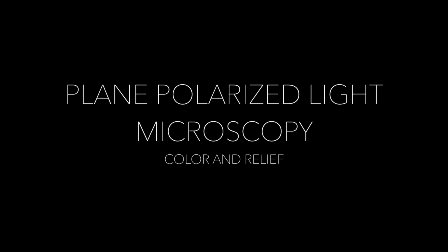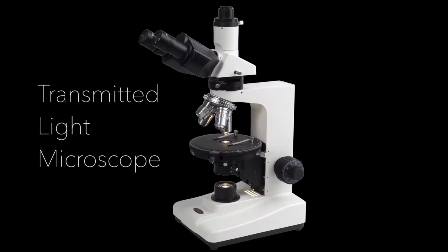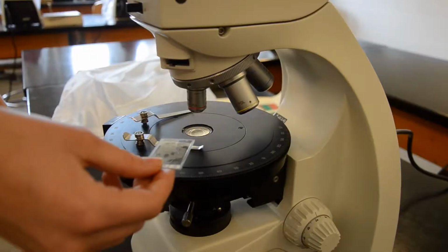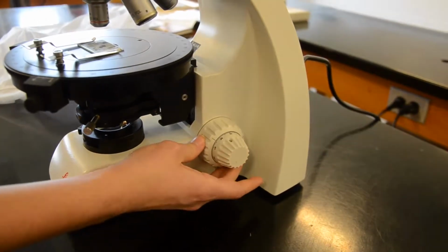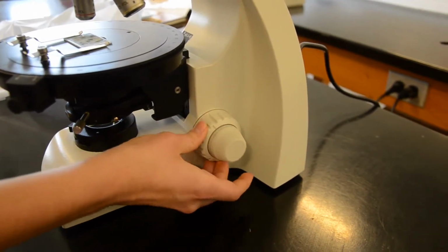In this video, I will be covering color and relief in plane polarized light. Here we are working with a transmitted light microscope, where light is directed up through the slide. To get started, I set up a slide on the stage of my microscope. Then I focus. Now I can begin to make observations in polarized light.